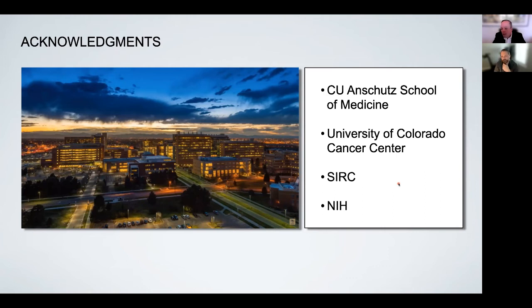So you saw the example from Jeff Gift's lab of this RNA. RNAs, of course, are very dense in the electron microscope. It would be a little more challenging to visualize a 50 kilodalton protein, but it definitely can be done, especially in stain. So if your two molecules that you're interested in monitoring interaction are over 50 kilodaltons, that can definitely be done by EM. The other issue is the stability of the interaction, right?